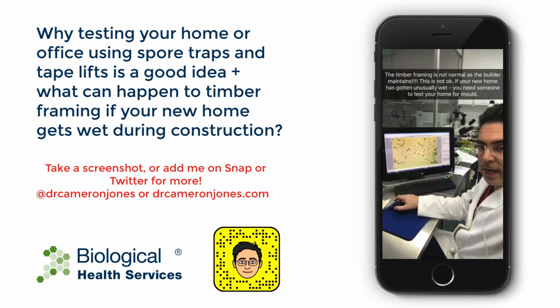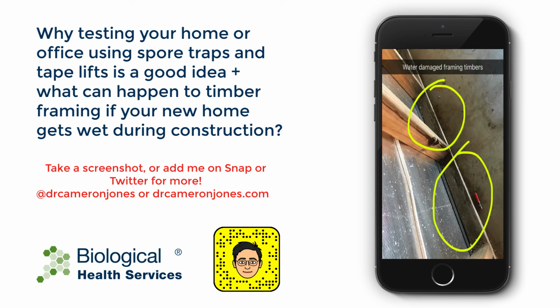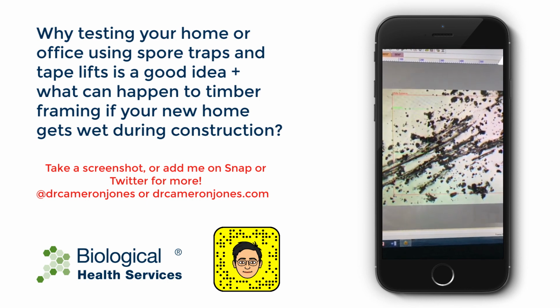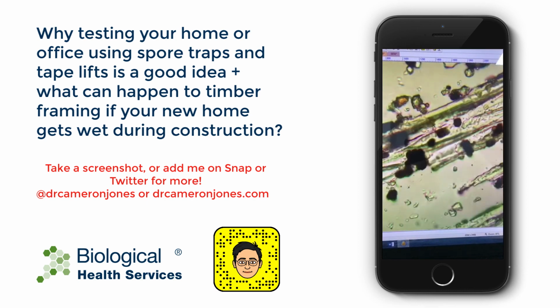Now let's look at these tape lifts under the microscope, and you can see that there's just a huge number of fungal spores and lots of alternaria. Tape lifts are very useful for visualizing the mould spores relative to the timber framing fibres. We can see that this just isn't normal.